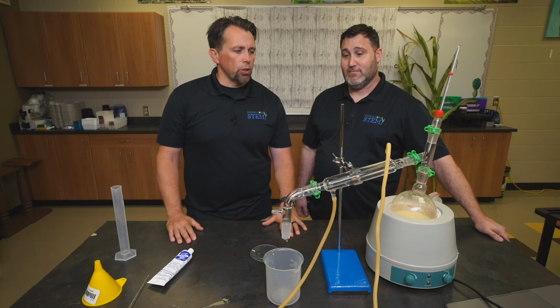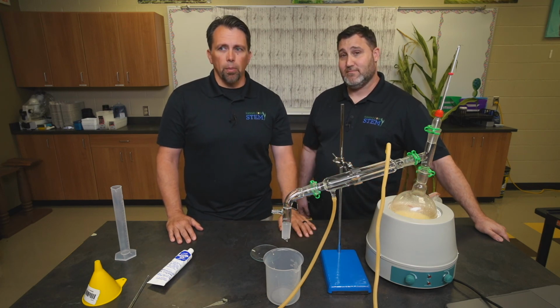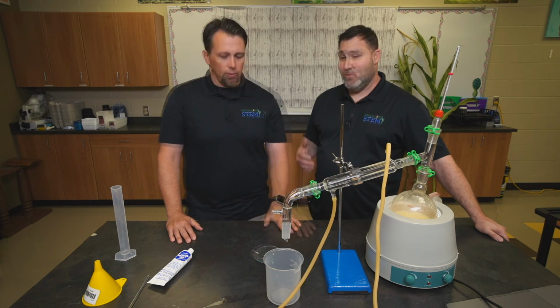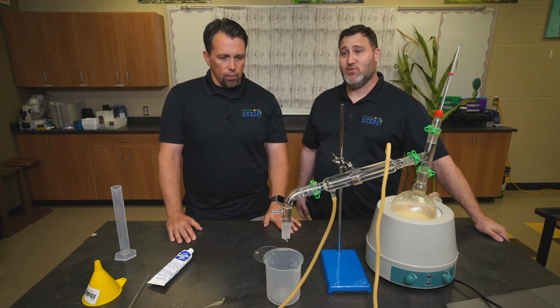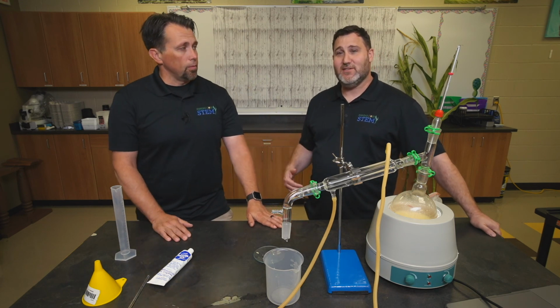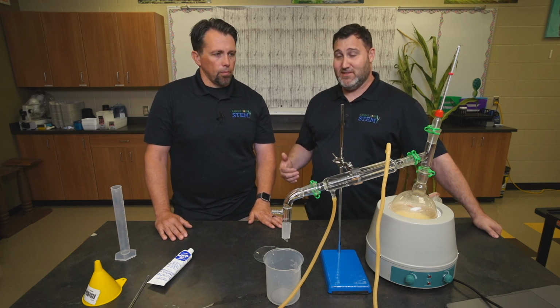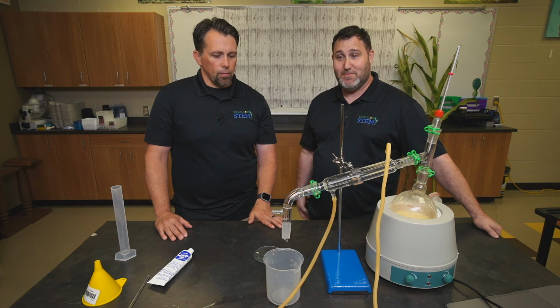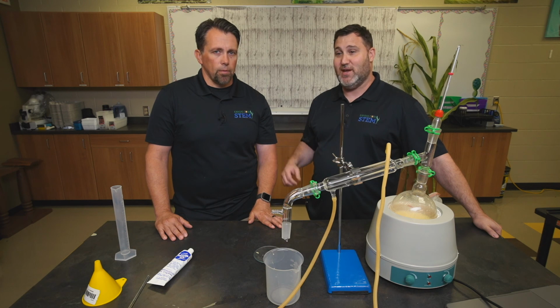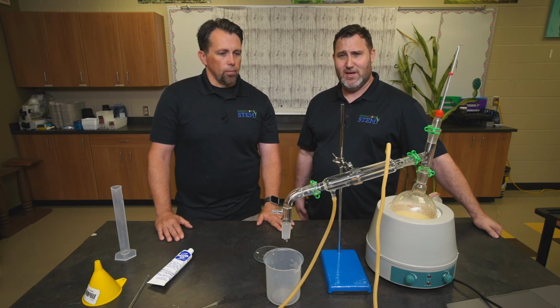If you attend a Seed to Stem workshop, the glassware, the mantle, and ring stands are provided by Renew Kansas and Kansas Corn. We'd love to see you guys work with this equipment, making ethanol in your classroom with your students. As you can see, it's not a hard lab, but there are some technical aspects to it. If you run into any issues whatsoever, you're welcome to contact myself or James. You can get a hold of us through Kansas Corn STEM, and we'll be available for any questions you might have.